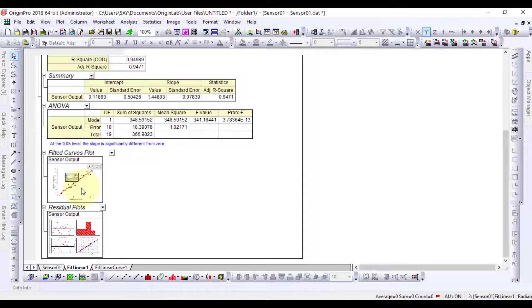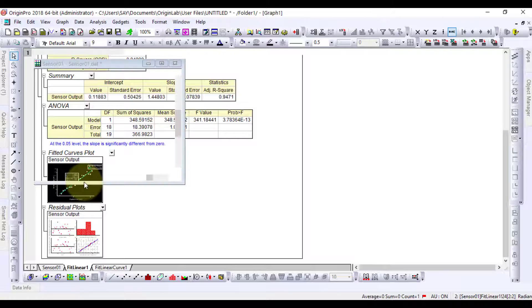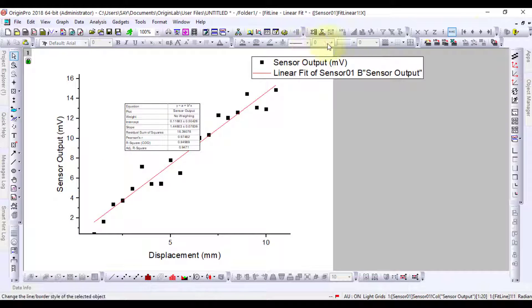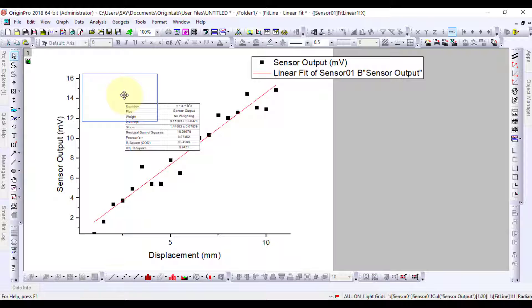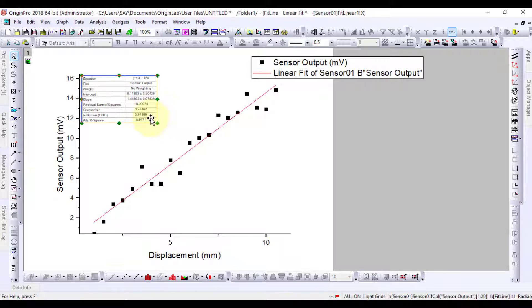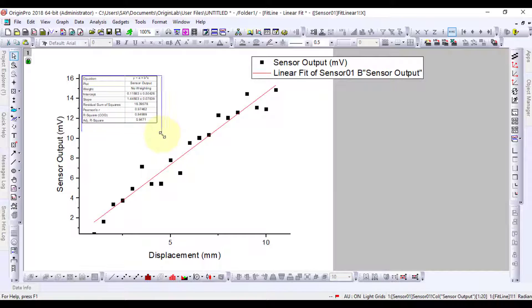Double click this plot to open it in a new tab. Now, I will do some changes to the plot to give it a good look, which can be used as a template for the other data.